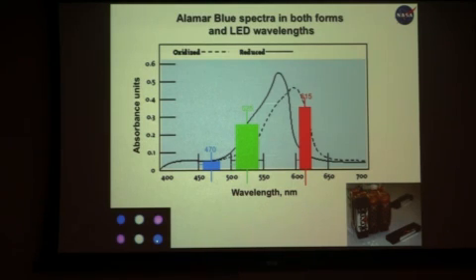So the red light is very good at being absorbed by the blue color. The green light's nicely absorbed by the pink color. And the blue light sort of passes with almost the same small amount of absorbance through both. And so these two let us look at how much of two forms of the dye, the unmetabolized and the metabolized, are present, and this lets us count the cells.